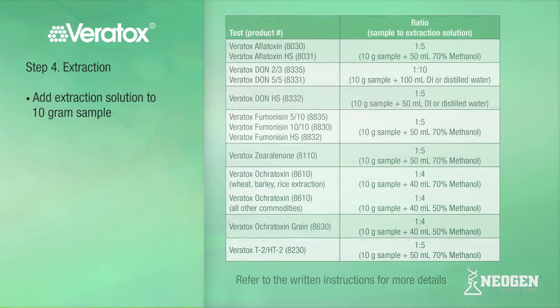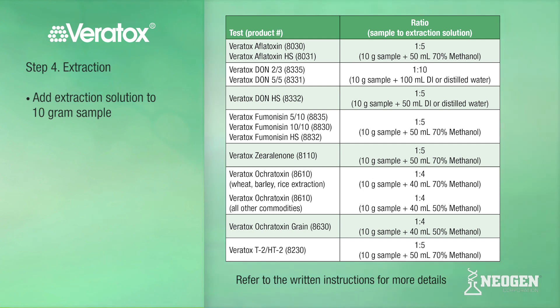DON samples will be extracted in deionized or distilled water. Ocratoxin is extracted in either 50% or 70% methanol, and all others utilize a 70% methanol solution. Using this chart, add the correct volume of your extraction solution to your 10-gram sample. For the Veritox Aflatoxin extraction, we will add 50 milliliters of 70% methanol to our 10-gram sample.